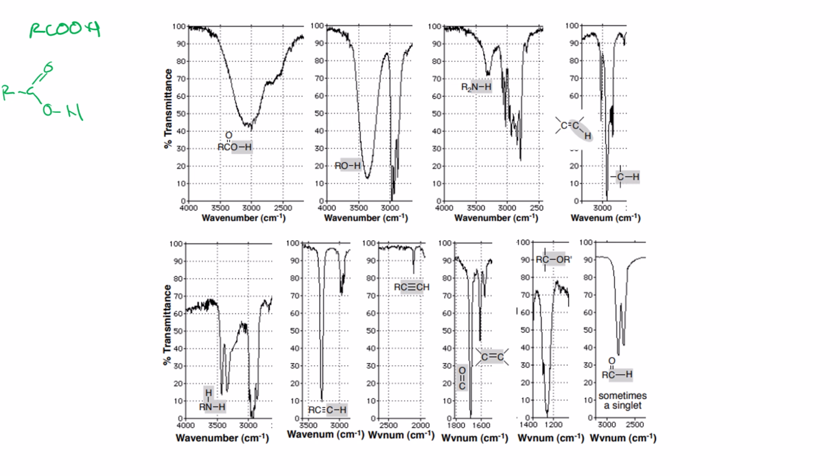The band is very broad. As you can see, this goes from 2300 to 3600, so very broad. And sometimes so intense also that it covers other bands. And the reason for that is that we have hydrogen bonding interaction.